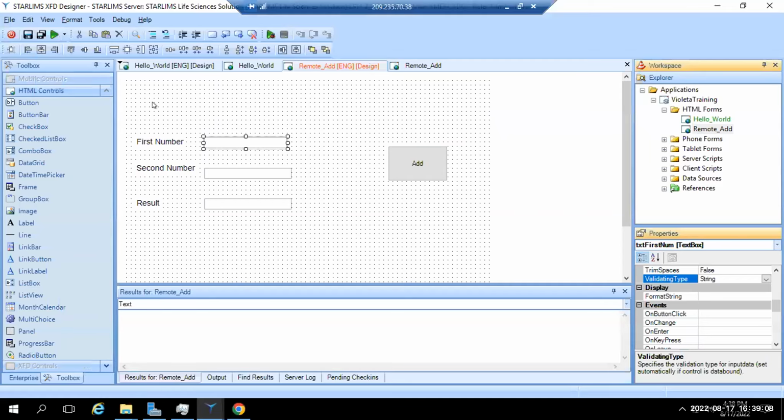Yes, Jose. I don't know if it's normal, but the tools button for me, the toolbox, it disappeared. Okay, I think we can get it back. In view. Yeah, try view toolbox. Here it is. Okay, got it. Thank you. You got it back. All right, guys.